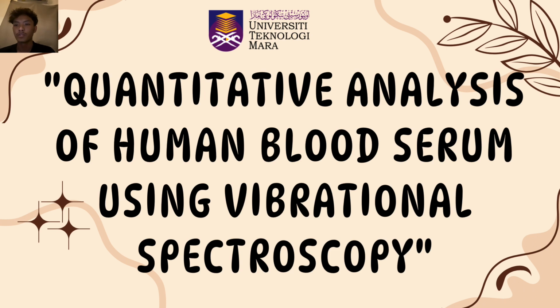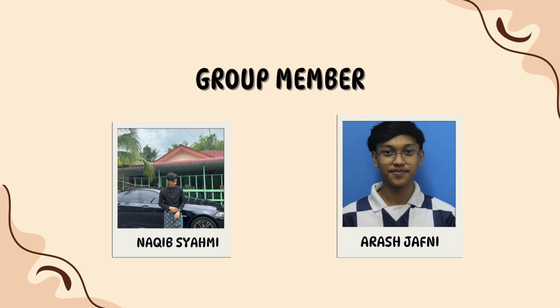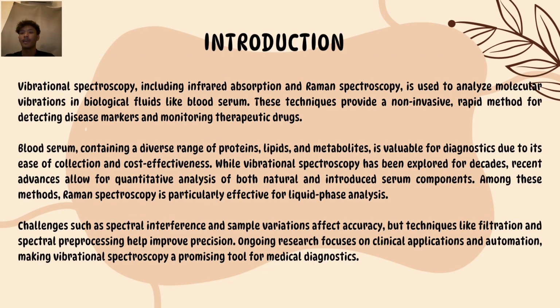Jafni. Today we will explore how spectroscopy techniques like FTIR and Raman are transforming medical diagnostics through non-invasive analysis of blood serum. And we are going to the introduction first.